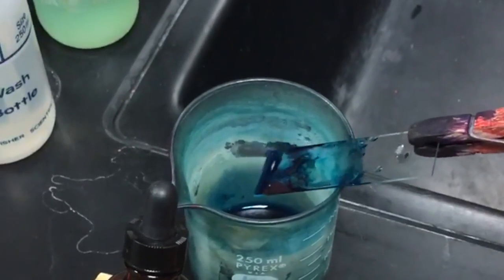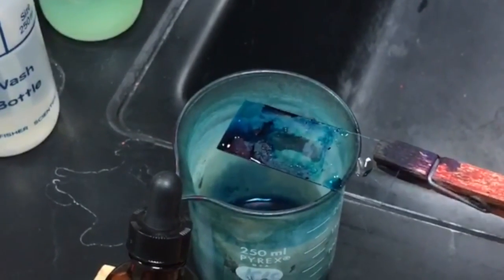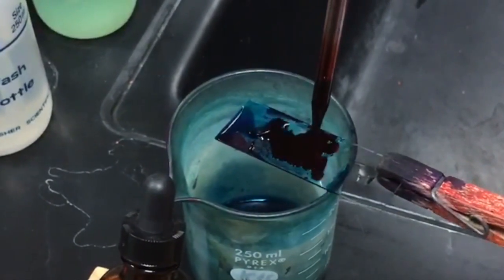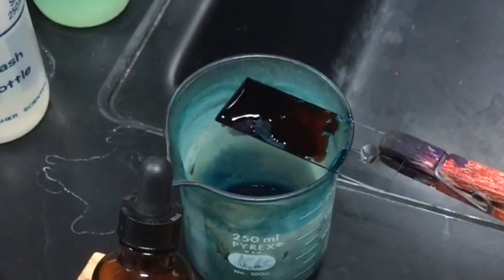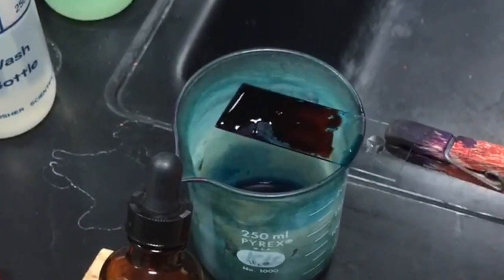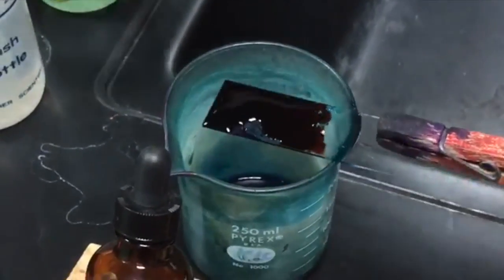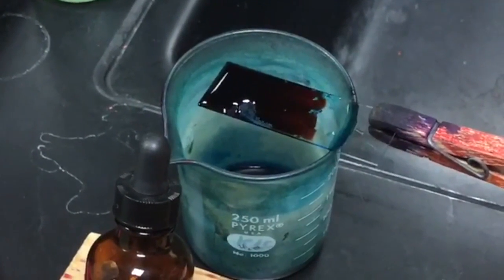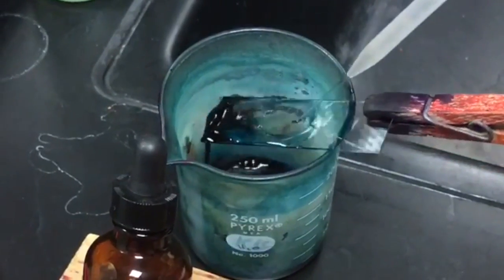Then you're going to use safranin to counter-stain the malachite green. Just let it sit there for about 30 seconds. Once your 30 seconds is up, you're going to use DI water again to rinse the slide in the waterfall. You're going to use the bibulous paper to blot it.